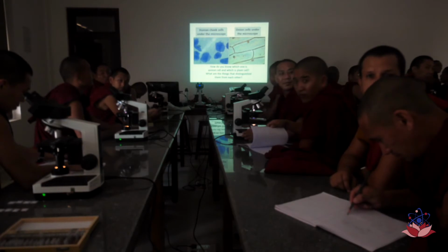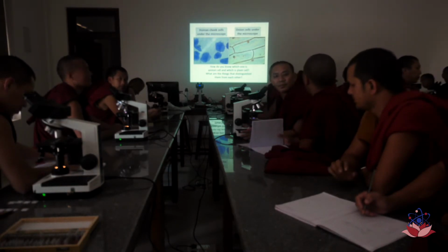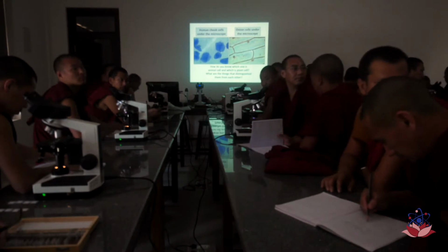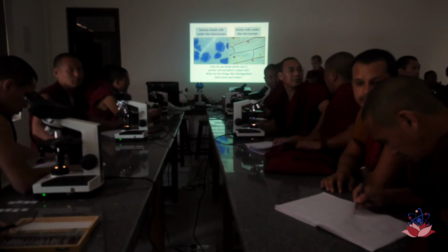Be Vanna White. So back here we have the slides, and be careful with them, they're glass. Don't cut yourself.